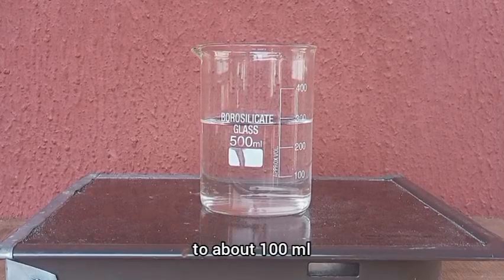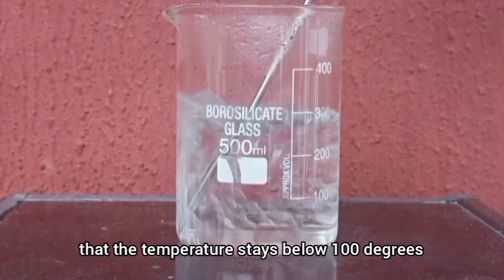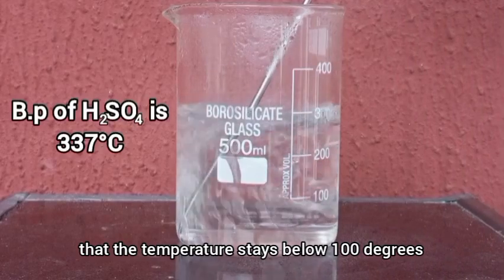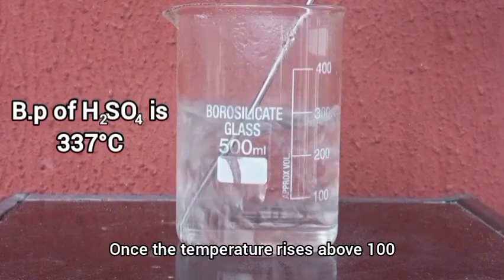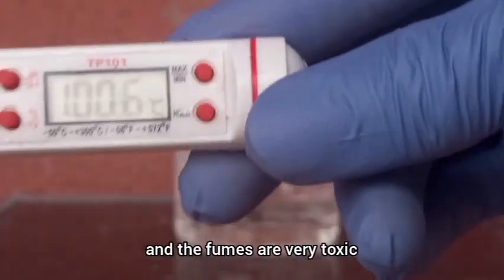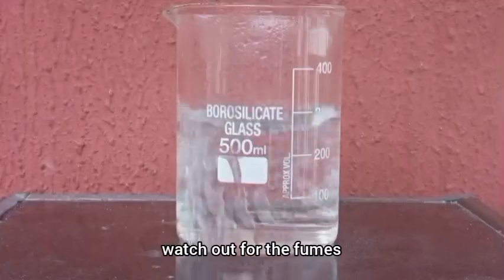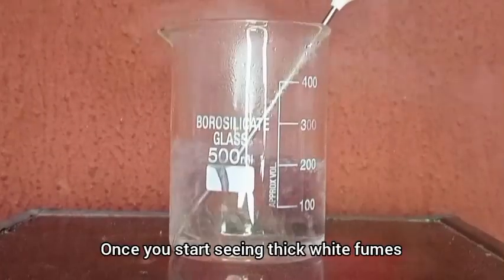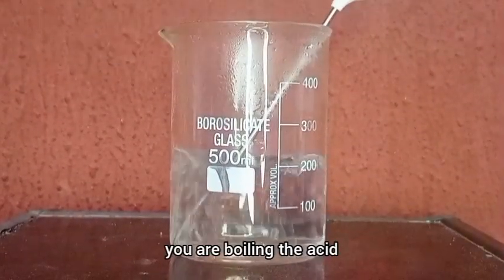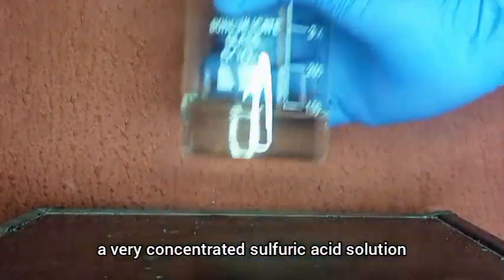As we boil, we try to ensure that the temperature stays below 100°C. Once the temperature rises above 100°C you are boiling the acid and the fumes are very toxic. If you don't have a thermometer, watch out for thick white fumes — once you start seeing those you are boiling the acid and would have to stop, unless you want a very concentrated sulfuric acid solution.